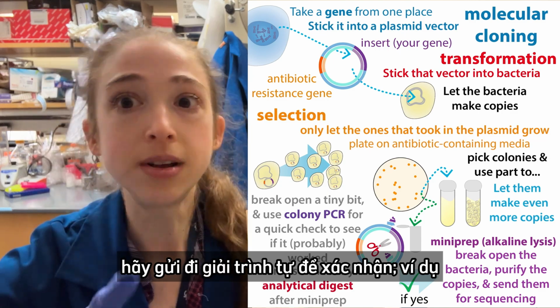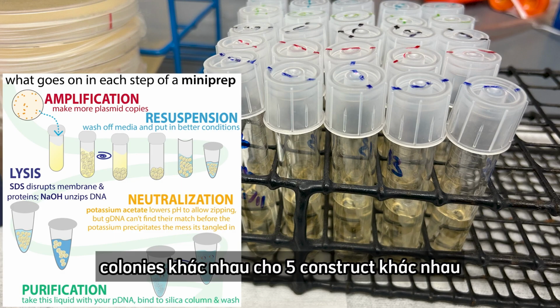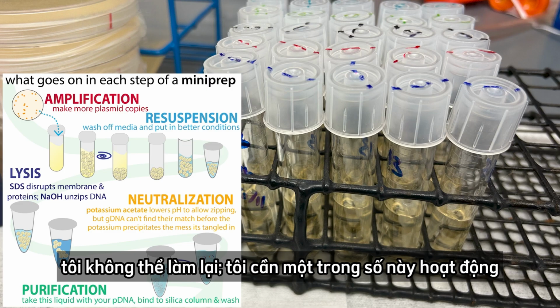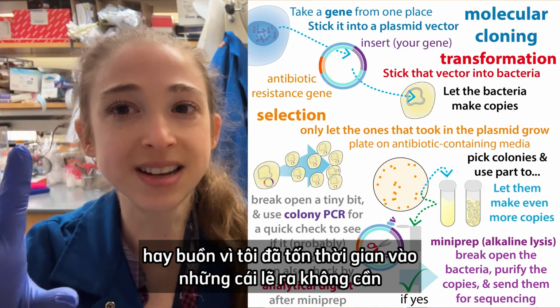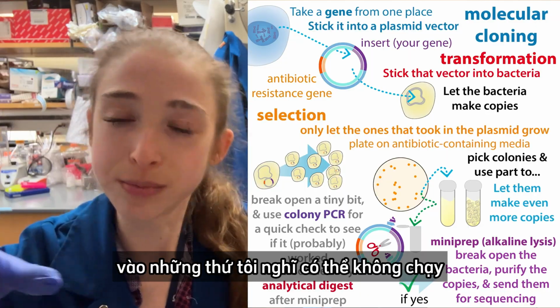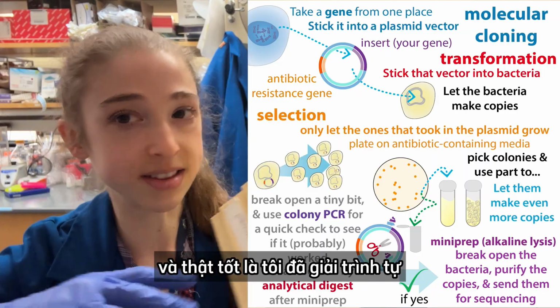For example, I recently did 25 mini preps on Monday because I was sending 5 different colonies for 5 different constructs, and it was a time crunch, so I thought, I can't redo this, I need one of these to work. Then almost all of them worked, and I wasn't sure whether to be happy that they all worked, or to be sad that I wasted all that time on ones that were working because I thought they might not work. But anyway, most of them worked, but there were a few that didn't. And so it was a good thing that I'd done that sequencing.